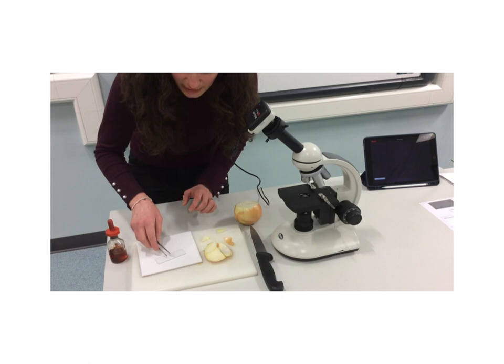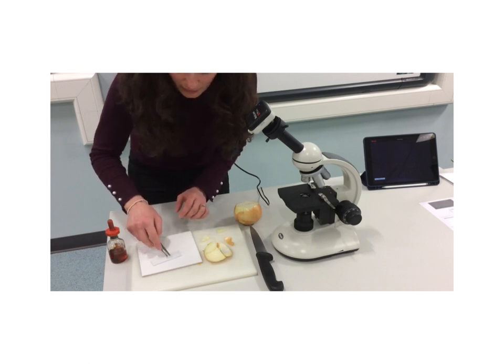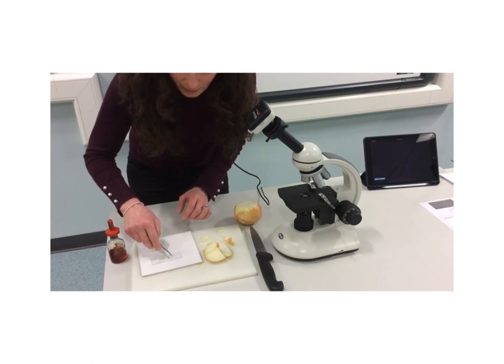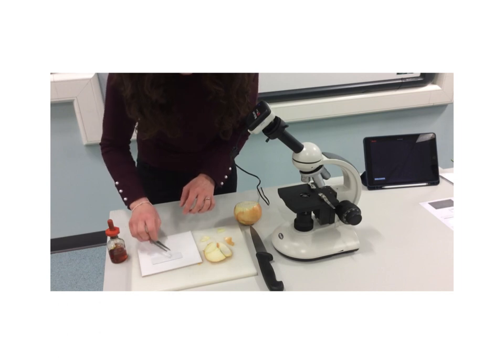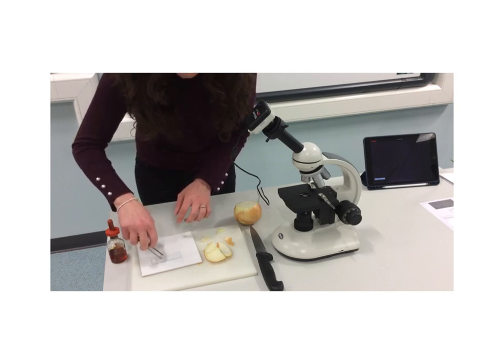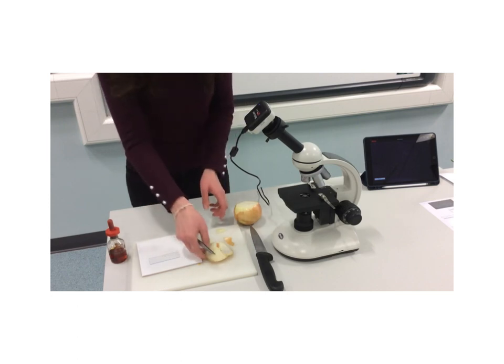Remember we want to try and avoid using our fingers, otherwise we can get fingerprints on our image as well, but this does not want to stick. The other side. There we go. So I want to put that down as flat as I can, but again, trying not to get any air bubbles.